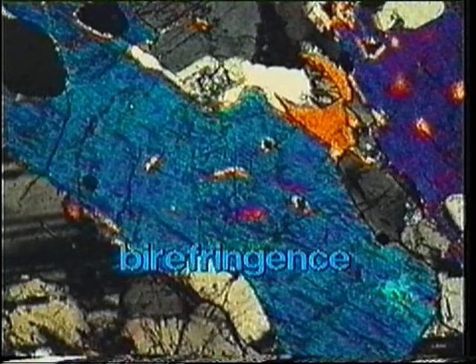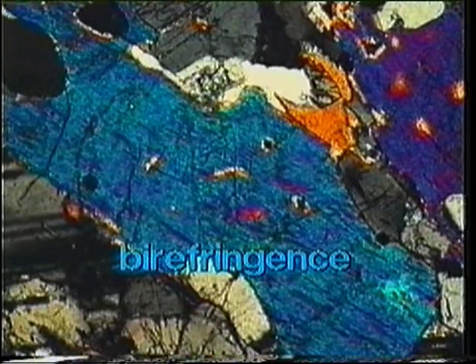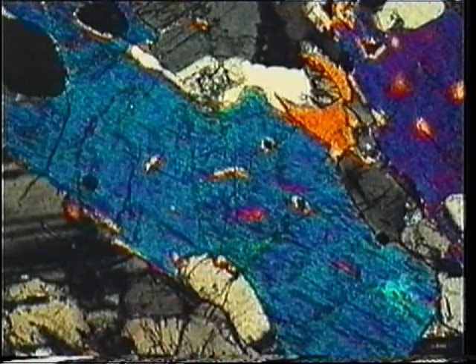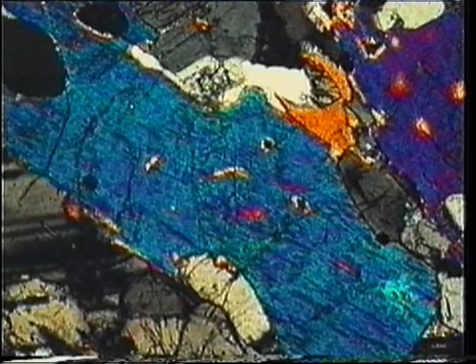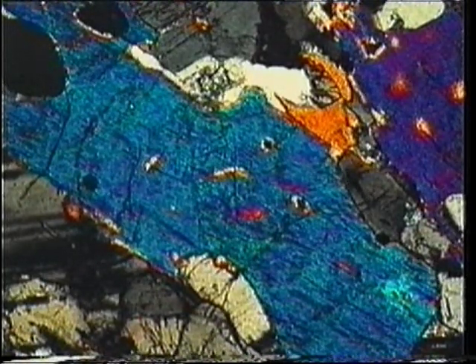The maximum interference colour is second order blue, a retardation of about 650 nanometres. Find the intersection on the interference colour chart between the second order blue and the 30 micrometre thickness line. The resulting birefringence is about 0.022.